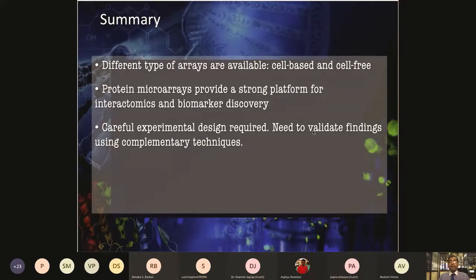In fact, the large biomarker discovery programs start with, let's say, we want to work on one of the cancer types and want to look for autoantibody response. So you start with, let's say, 200 chips, and those can be used for the discovery set. When you are looking at 30,000 spots printed on the arrays, you are looking for all the 200 patient samples to be screened. After doing the entire screening and analysis, you have found some proteins which are showing good response in different grade-wise comparison.